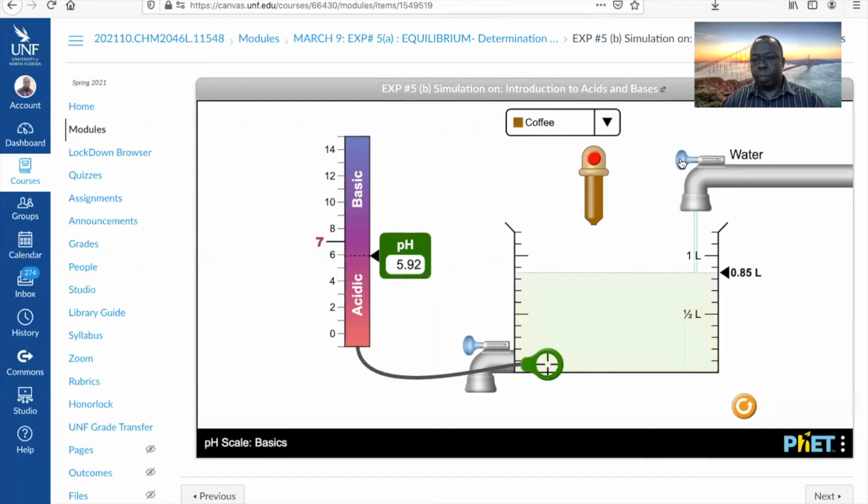You can remove the pH probe from the solution. Oh, I don't want to overshoot. This is tricky. Yeah, there we go. So it got to be 0.9. This is the pH after the dilution.